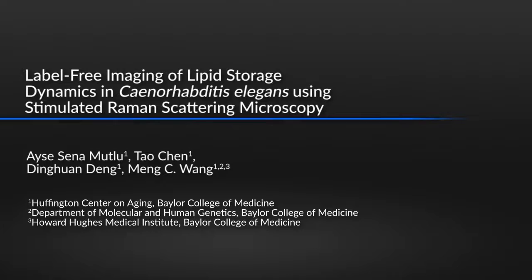Stimulated Raman scattering microscopy is a chemical imaging technology that enables the rapid and quantitative detection of lipids and allows the tracking of lipids in live animals in a label-free manner. The most important advantage of SRS microscopy over traditional lipid detection techniques is that it is label-free and therefore is not as susceptible to photobleaching as other fluorescence and staining methods.